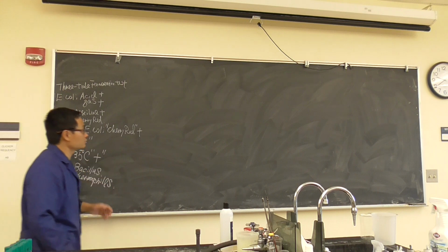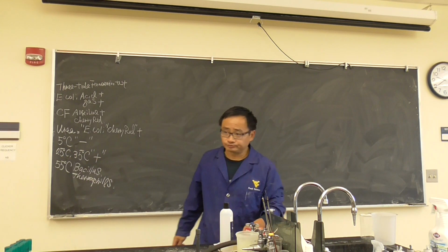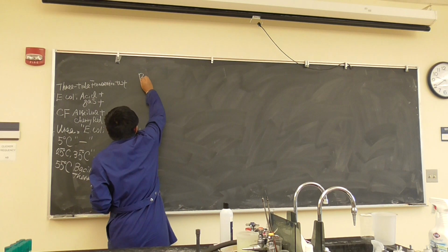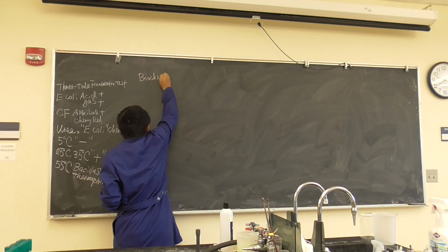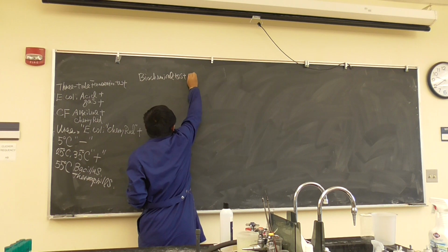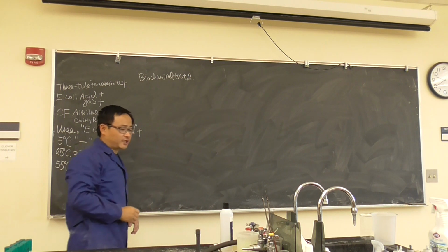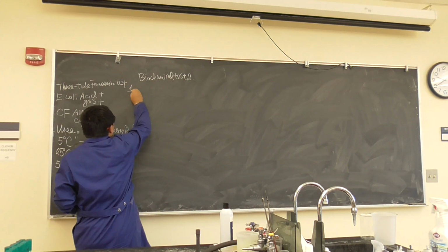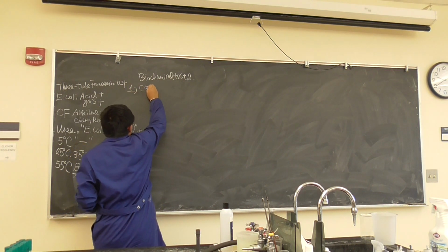So that's some conclusion from Tuesday. Okay, we're going to move on to today. The lab, biochemical test 2. We will do 5 tests today, so lots of work. Number 1, catalase test.